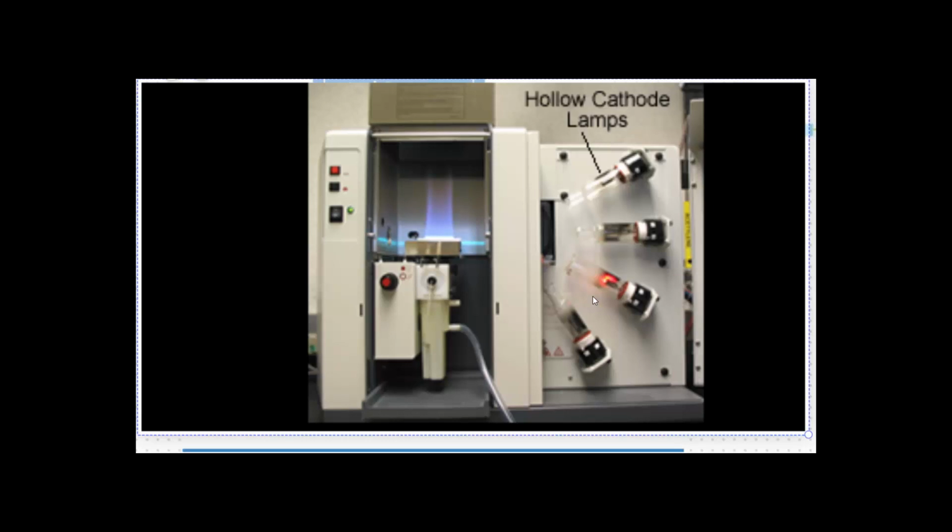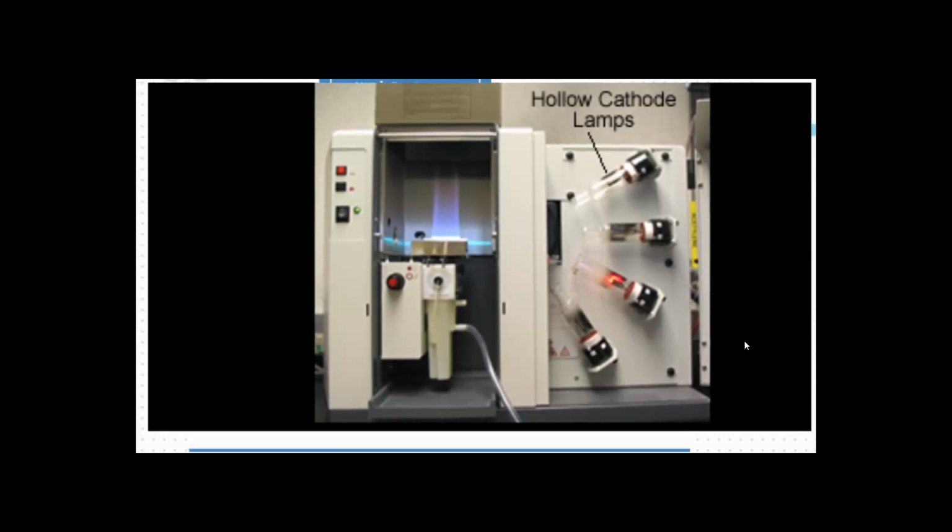Now here is an example of a flame atomic absorption spectrometer. It's a benchtop machine. It might be 2 or 3 feet tall, 2 feet deep, and 3 or 4 feet long, but you see these lamps over here on the right. There are 4 of them. So this one can measure 4 different wavelengths. Each element we're looking at is going to have its own lamp.